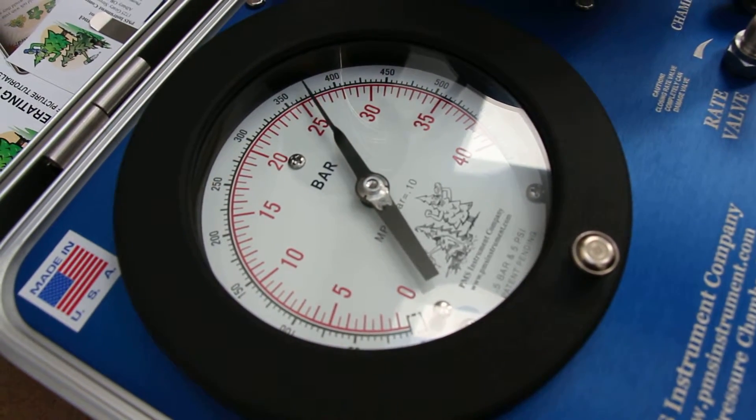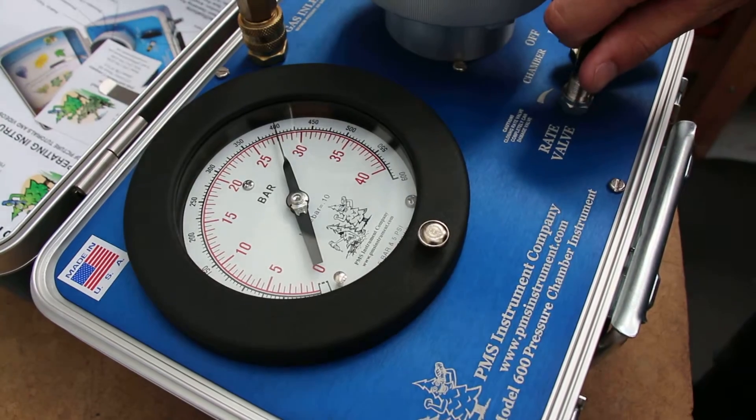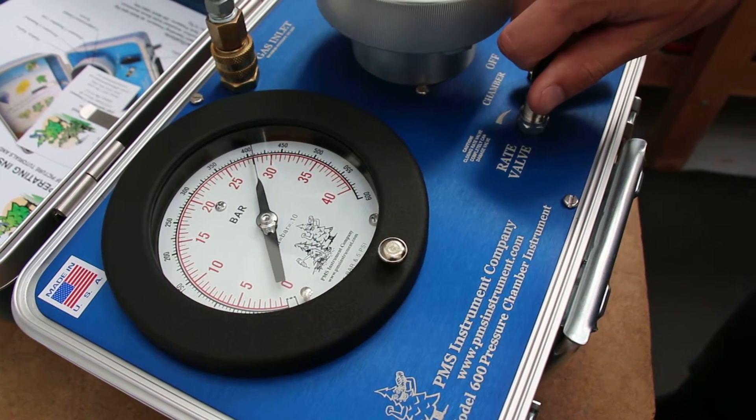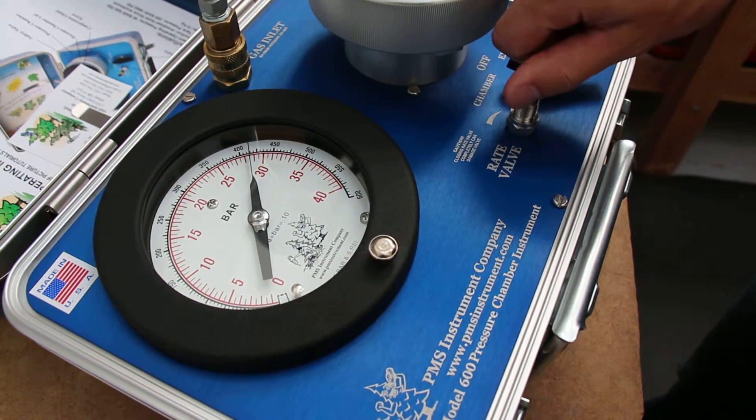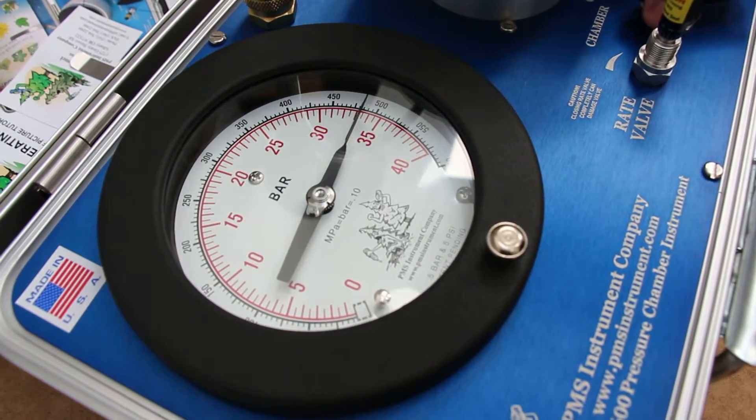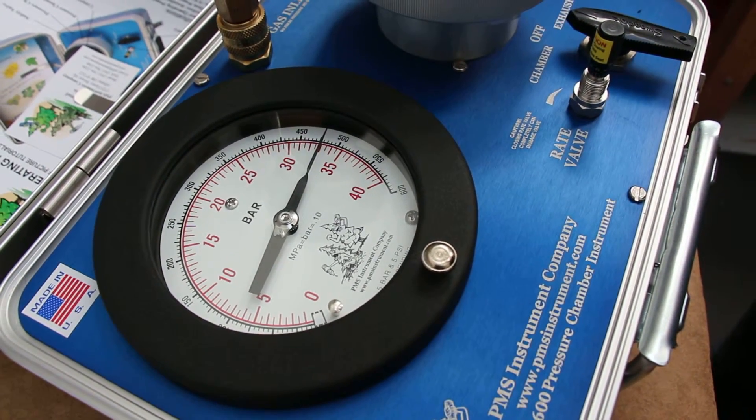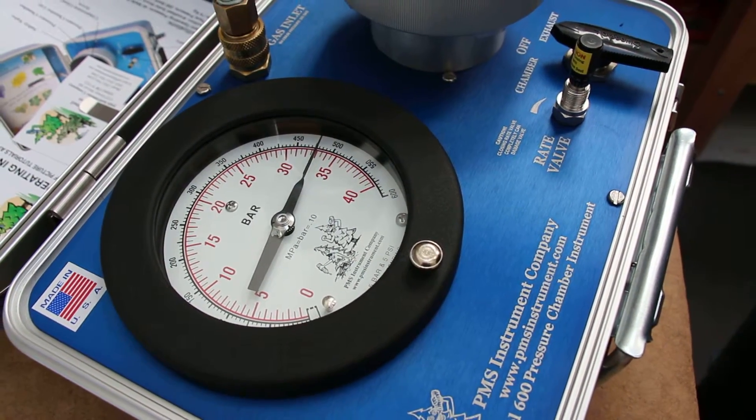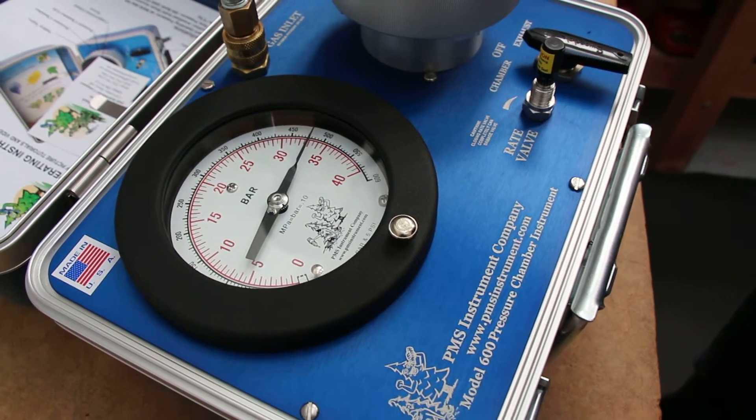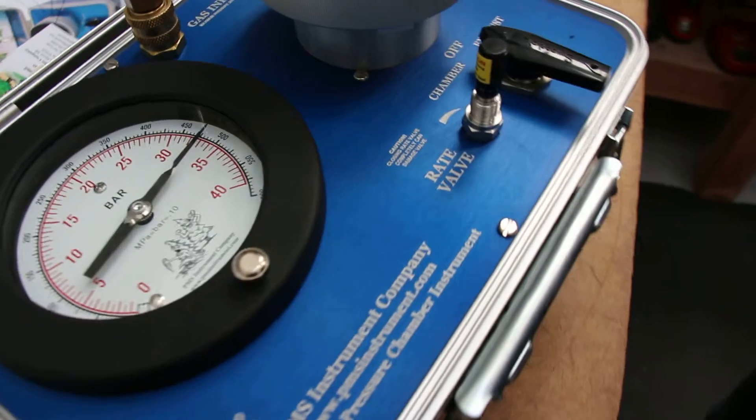The rate valve can be tightened further if necessary, or opened up to reach a higher pressure zone. You can open the rate valve to achieve that higher pressure before slowing it down to about half a bar per second.